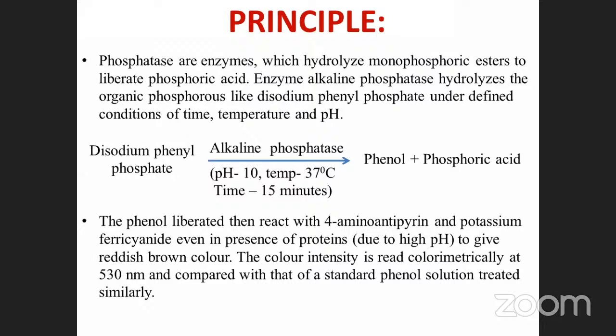These readings are not proper for the calculation purpose. That's why a specific wavelength is selected for the specific colored solution. And for this color, 530 nanometer is selected because at that wavelength we will get maximum optical density or absorbance of that color. Understood? This part is completed in colorimetry. Understood this principle?